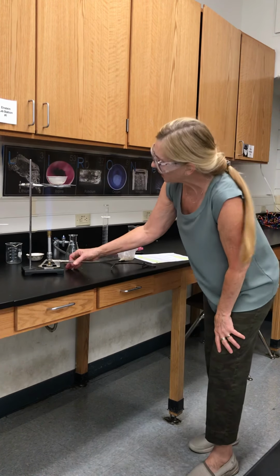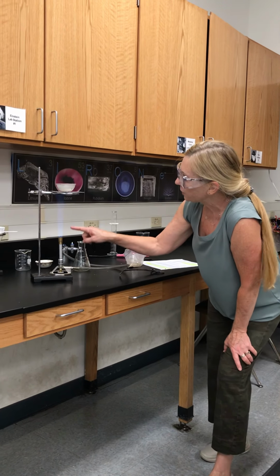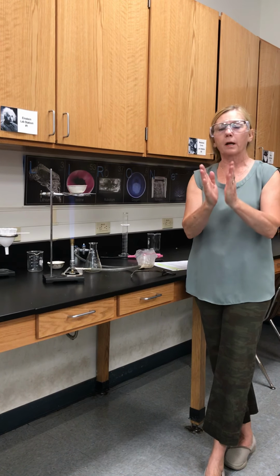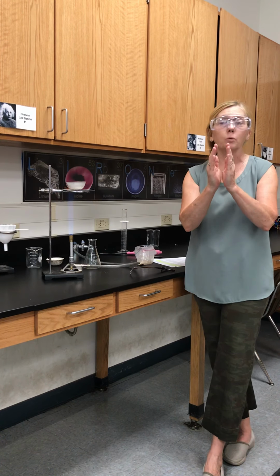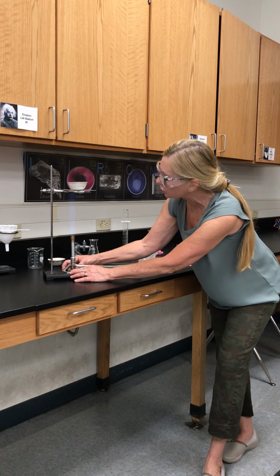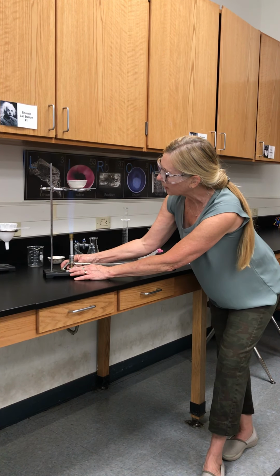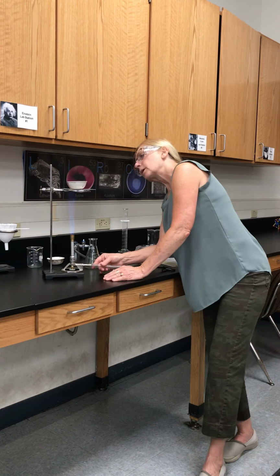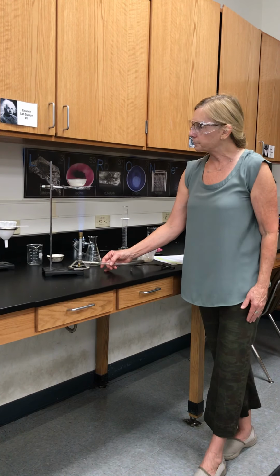So this is a pretty nice flame. When you're using the flame, if you look closely, you can see inside the outside flame there's a light blue inner flame, and we say it makes a cone. When it has a nice cone, that's good. If it doesn't have a nice cone, then you need to adjust by turning this at the bottom. We've got a nice one going on right now. So we need to get this out a little further. This ring is a little farther away.